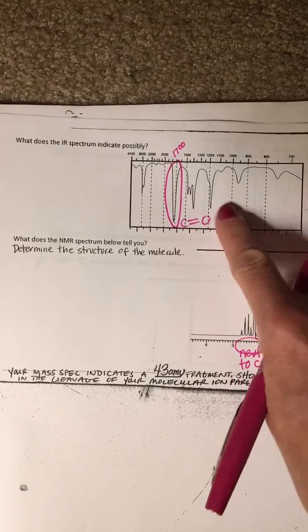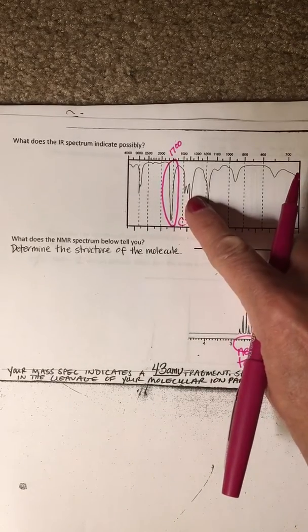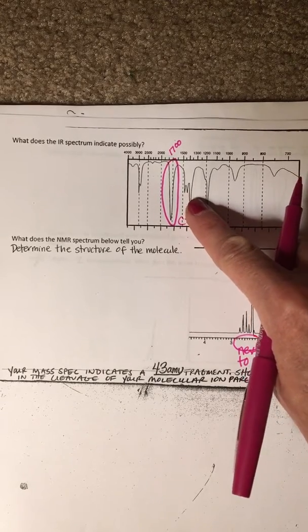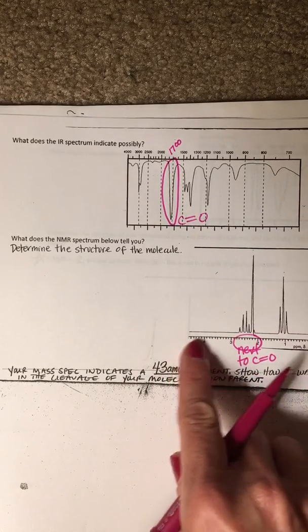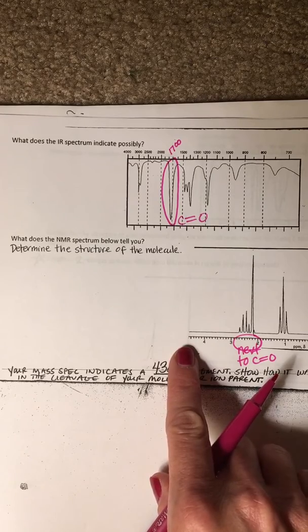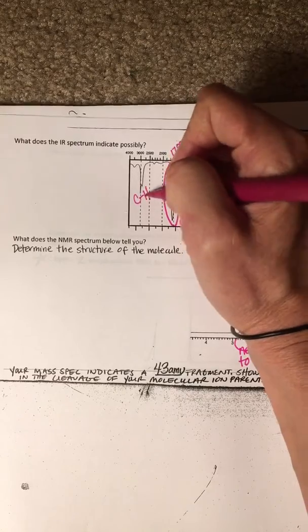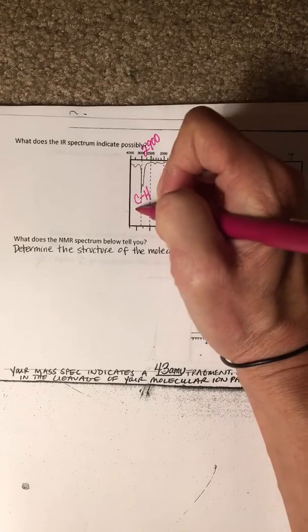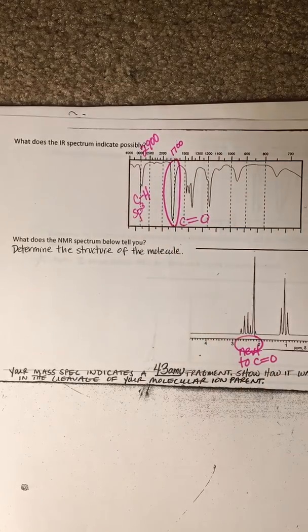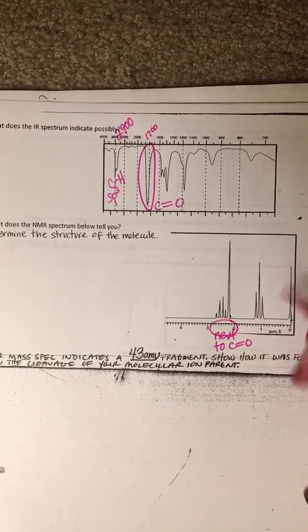Not too sure about any of that. Is it an aromatic? Is it not? A lot of people see 1400 to 1600 and label everything as an aromatic. I don't have a formula, so I can't check my degrees. I can check my NMR. There's nothing in that 7-ish region, so we don't have an aromatic. And then we do have our carbon-hydrogen stretching. It looks like it's at 2900, so probably our sp3 carbon-hydrogen stretching. And we do have alkyl area right here.